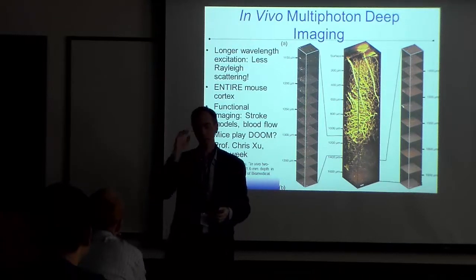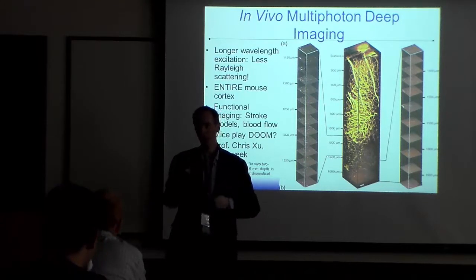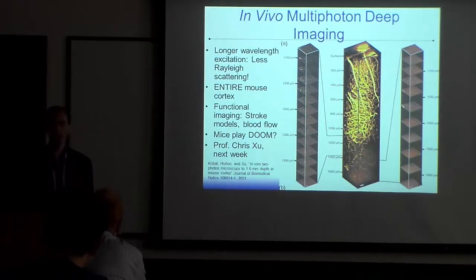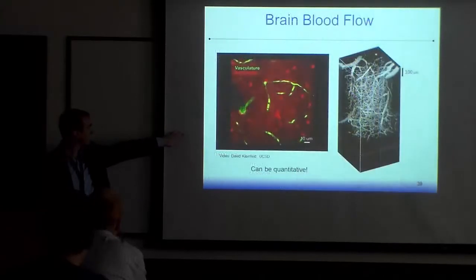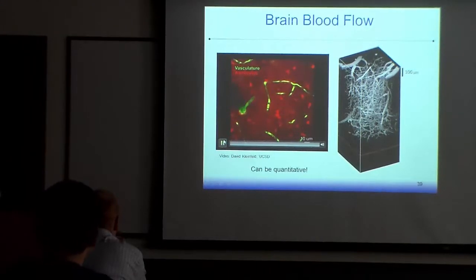And they were looking at basically the neurons firing as the mouse is trying to figure out this maze, which is entirely virtual as he runs on this trackball. And I mean, it's just a clever experiment. It's just one example of many that are going on that are kind of similar to this, and just a demonstration of what you can do with real functional imaging.